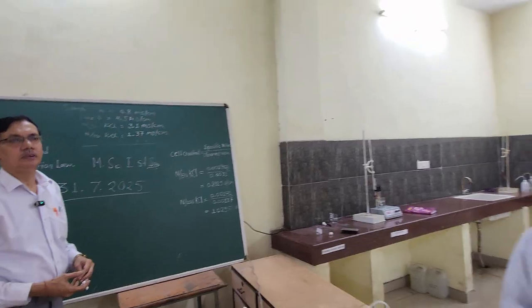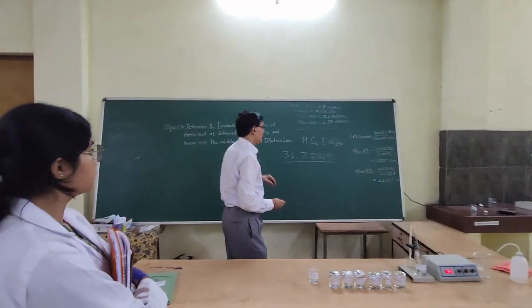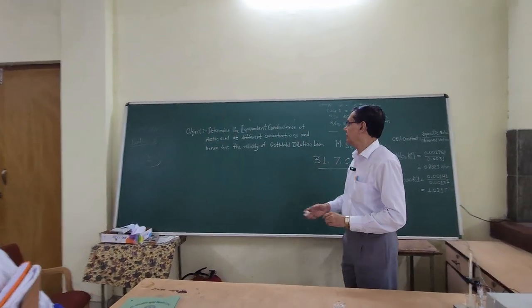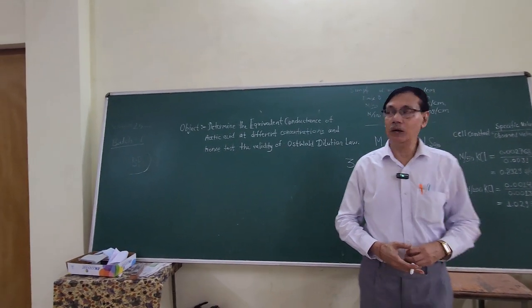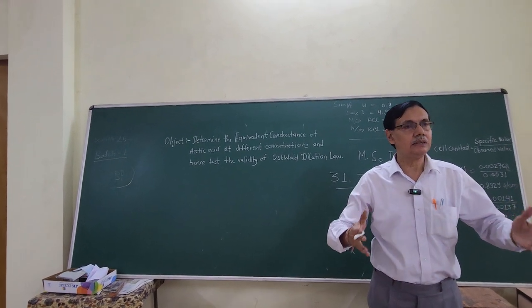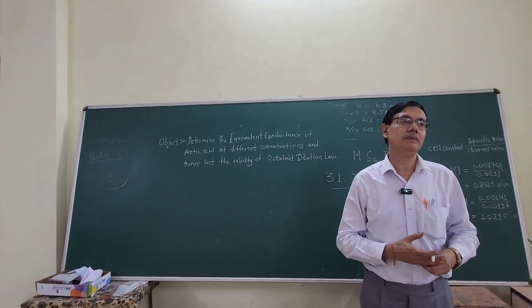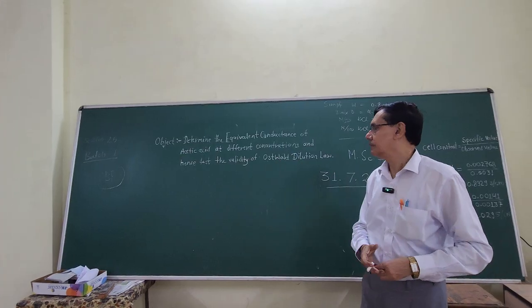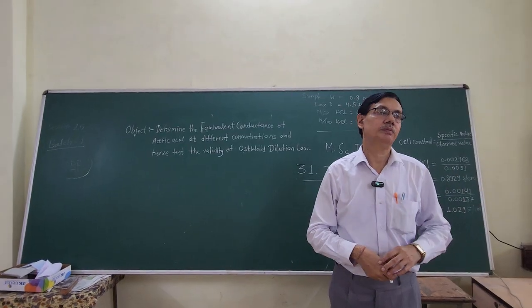Today I am demonstrating a very important and simple experiment, and the objective of this experiment is determination of equivalent conductance of different acetic acid solutions. And what is the purpose of this experiment? To verify the most important Ostwald dilution law.